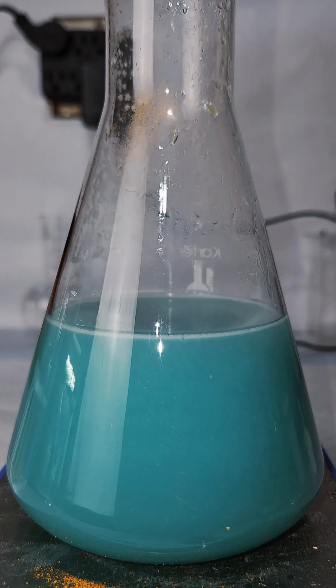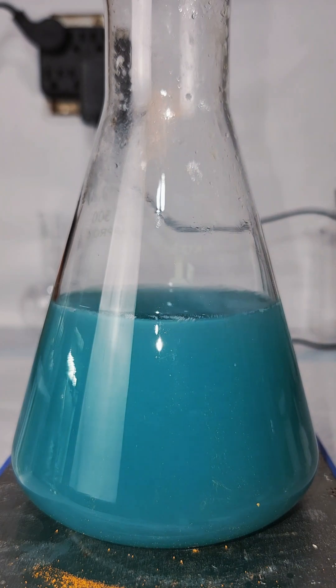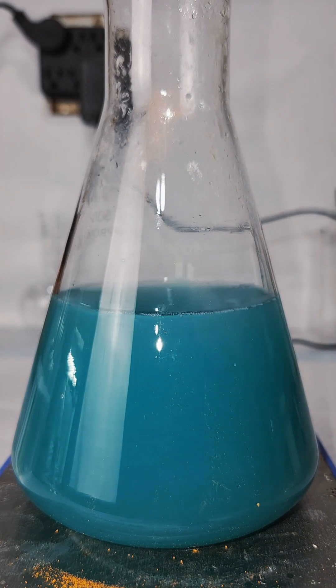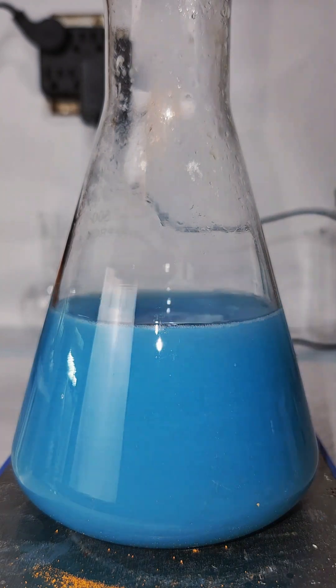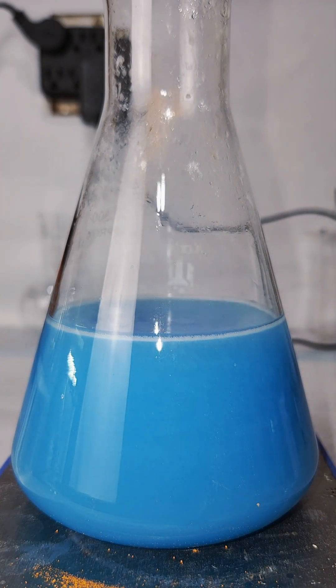Now the interesting part of this is that transition metal ions will typically have different colors depending on their oxidation state. And while the plus five state of vanadium is yellow, the plus four state is blue.